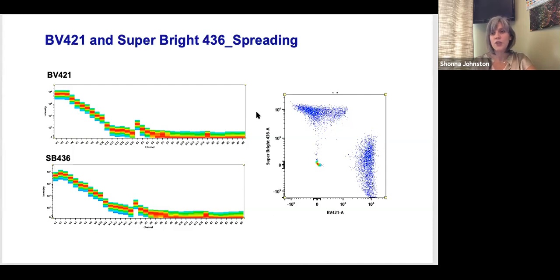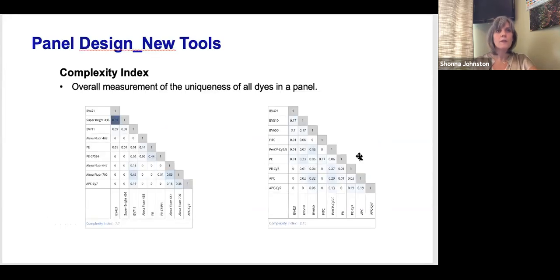You've got to make sure that when you're choosing your fluorochromes, you are still choosing them in a sensible manner and that you're not just choosing things that might work. It is always quite difficult to do that with researchers, but it is really, really important that you don't just assume that because it's spectral, you don't have any issues with these types of things.